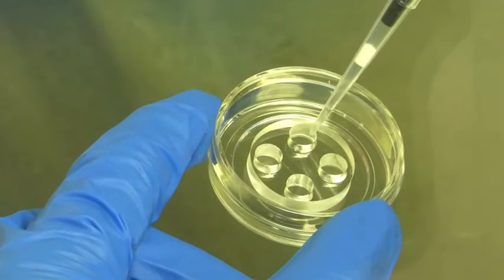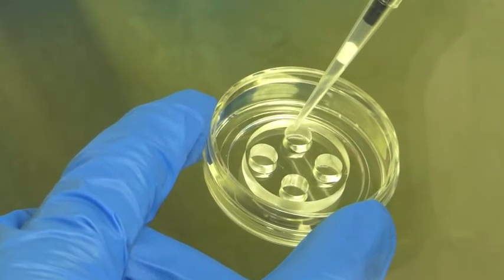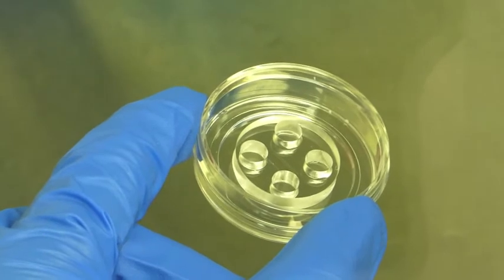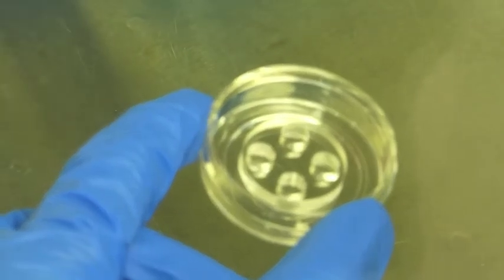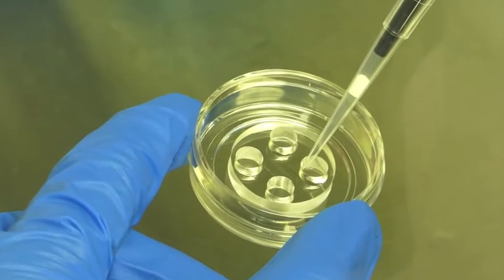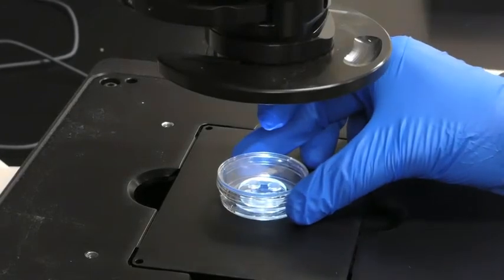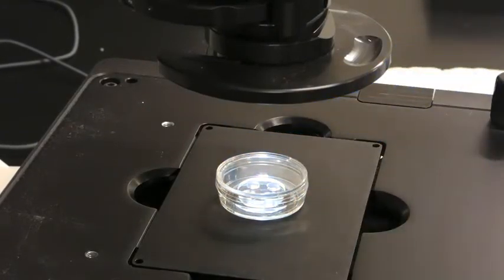Next, immediately load 5 microliters of the cell suspension into the upper right well and another 5 microliters of cell suspension in the lower right well. When loading the cells, point the tip of the pipette towards the main channel. After loading the cells, place the chip on the microscope stage and look at the sample through the optics to make sure that the neurons are in the main channel.